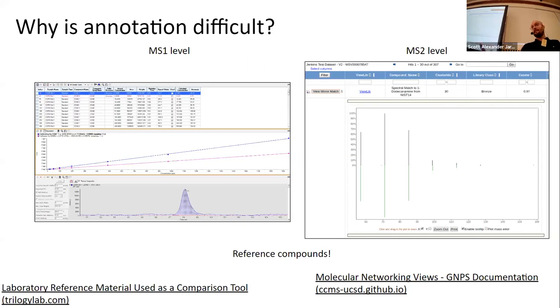Or a synthetic route is obviously a possible means, but for natural products, these are sometimes 60-step total syntheses. So entirely impractical in order to set up standard libraries. So for compounds like that, we rely heavily on the MS2, but this is also a challenge because we need the community to deposit the spectra into the databases.